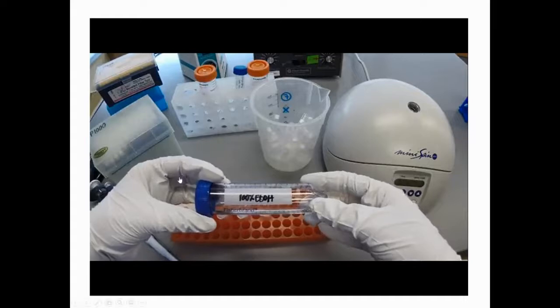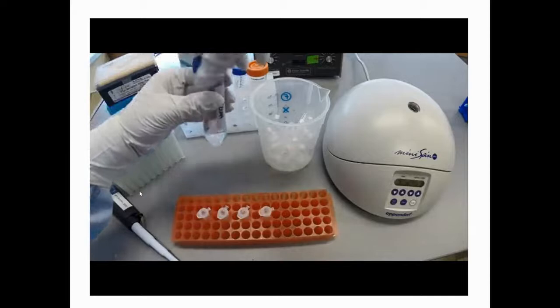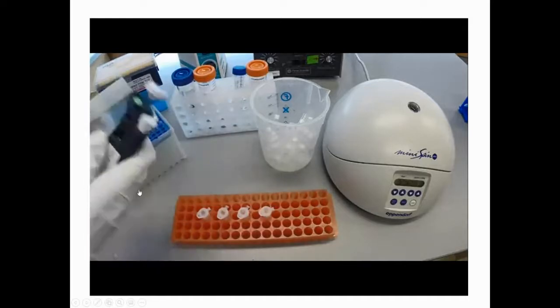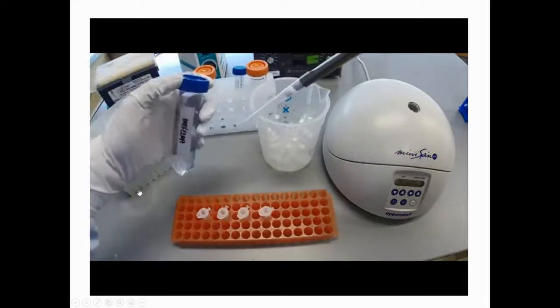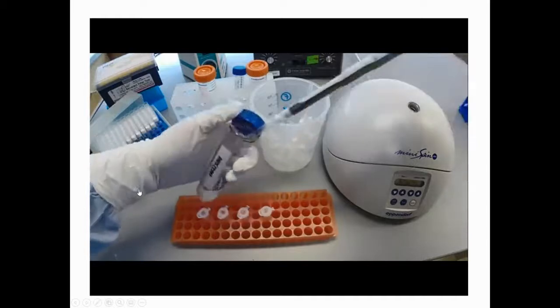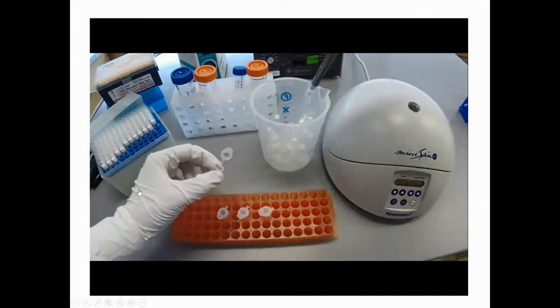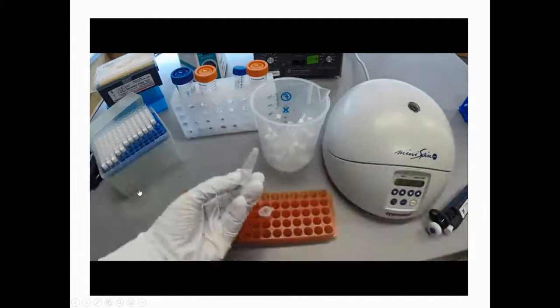Sample. And mix by inversion 10 times. The solution may become cloudy. This is normal.